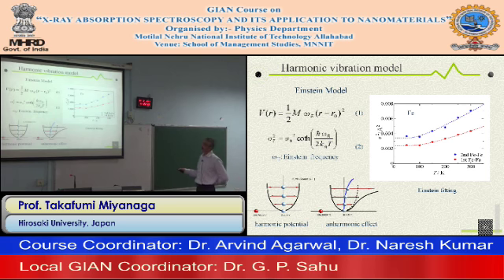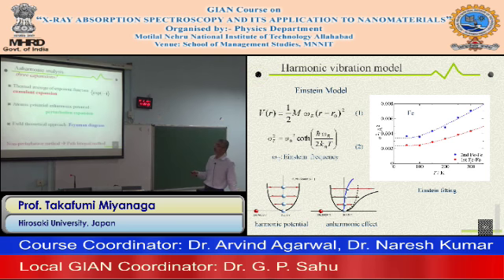This analysis is applicable to harmonic systems, but usual realistic systems have an anharmonic effect. That is how we take into account the anharmonic part for the X-ray absorption analysis. So now I will show you the anharmonic analysis of the X-ray absorption thermal vibrations.